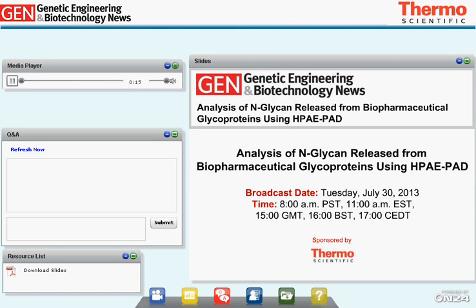One of the most critical activities involved in the development of a novel biopharmaceutical involves protein glycosylation. Now, it's a fact that new drug discoveries get all the headlines, and all the benefits of FDA-approved biotherapeutics are touted in most forms of traditional and online media. But if the analysis of the glycan pattern of a recombinant protein drug is carried out incorrectly, that's a problem. And all the data regarding product characterization and quality control will be called into question. In other words, drug development here will be set back, and any headlines that may appear will definitely not be positive. How to avoid this?